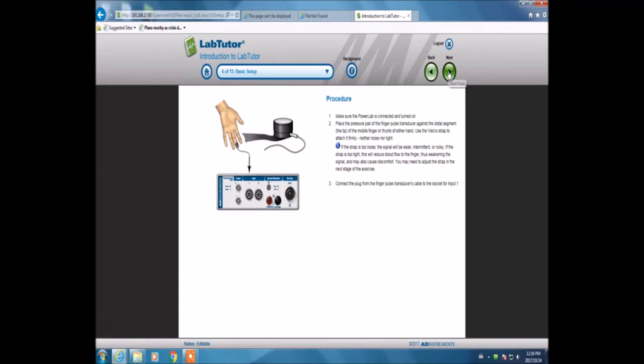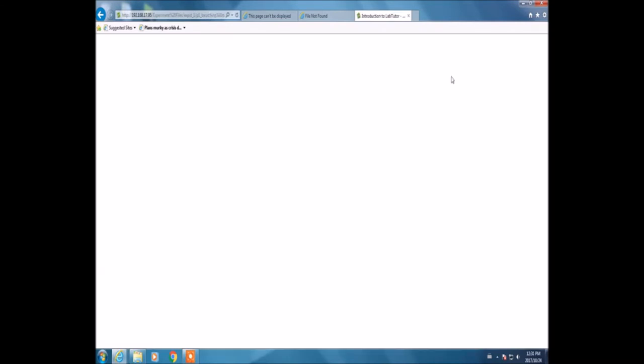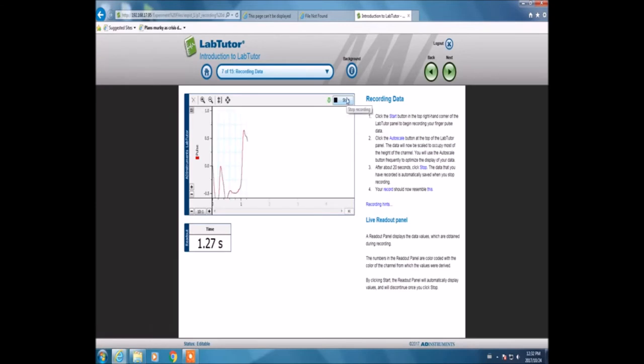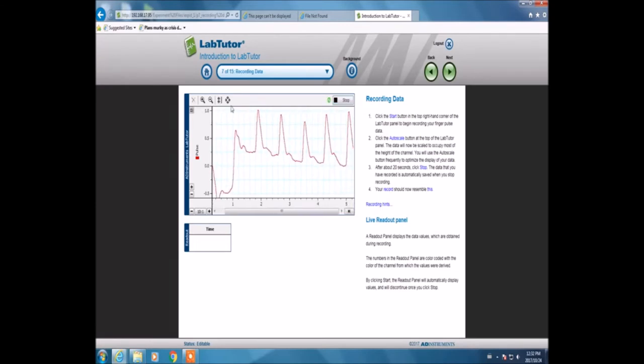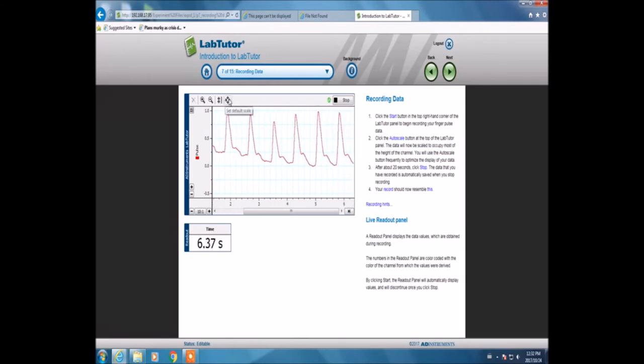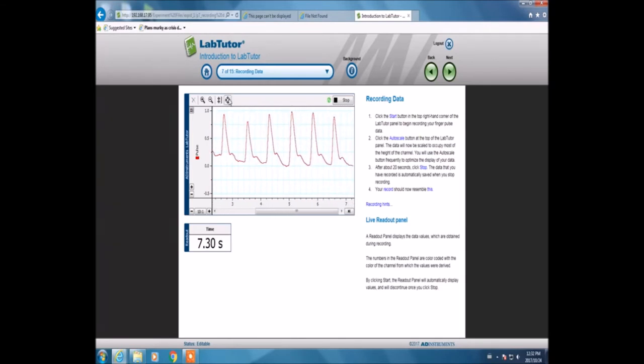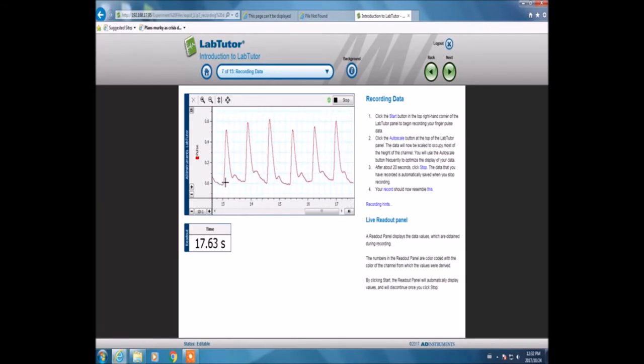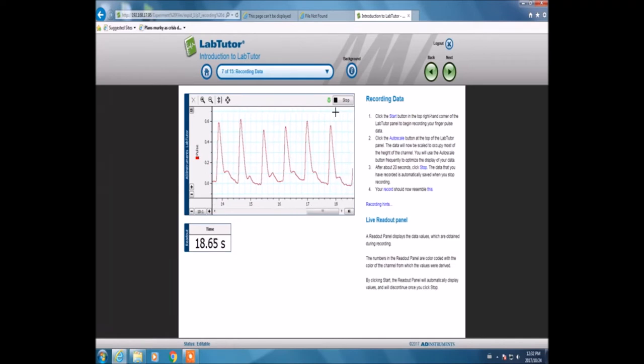This is the procedure, which shows me how the experiment is performed and which components to use. This is where the data is recorded. We'll press start over here and record for 20 seconds. After 20 seconds, we'll press stop again at the top right corner.